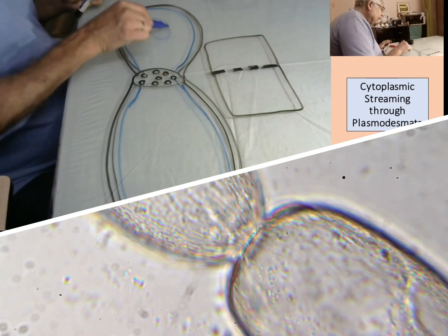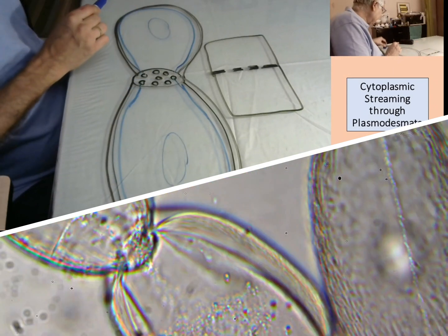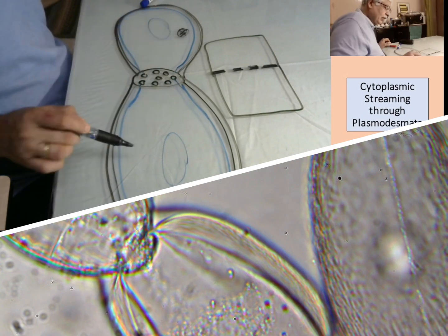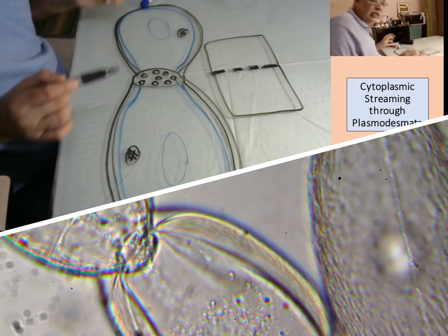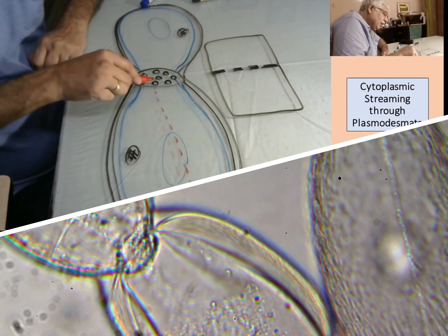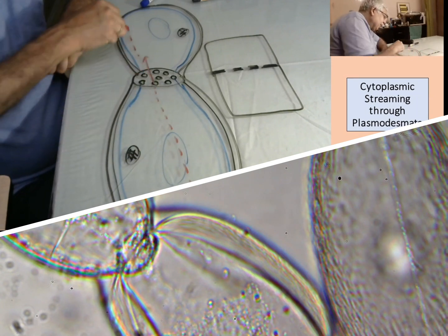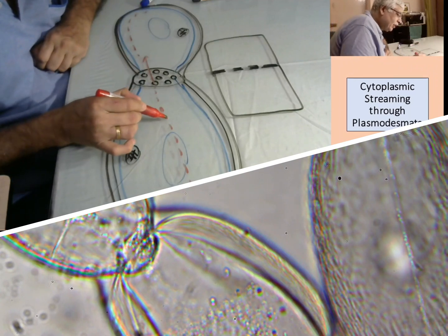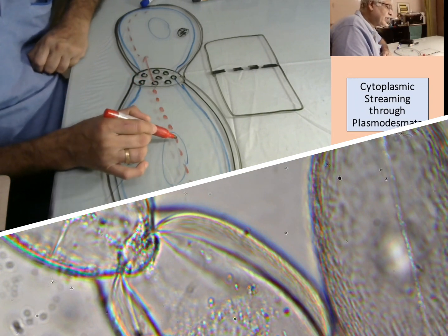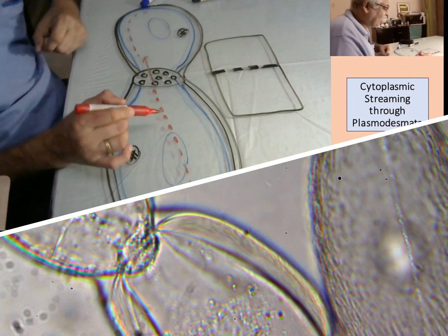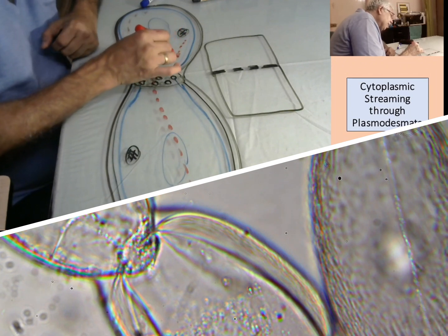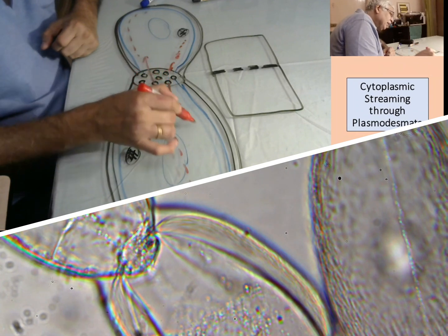Now inside the cell you can see — or rather guess — the vacuole. You can also see the nucleus. We find the nucleus is a little denser. And there is cytoplasmic streaming — sometimes it goes above the vacuole and goes through one cell to another and continues. We can see a bluish blob here which may be denser cytoplasm or some organelle that appears transparent due to light diffraction, showing a green blob. We can see sometimes the cell is sending the cytoplasm the other way — this we call cytoplasmic streaming.